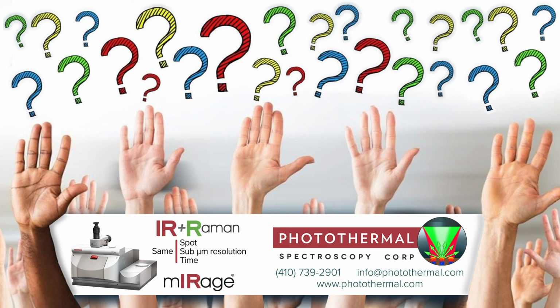All right, so this is something that I get quite excited about, because we talk a lot about spatial resolution. That's quite clear in the images, in the fact that you can see smaller things. But there's an added benefit which isn't always obvious, and that's when you have that higher resolution, it means that you are now collecting spectral information from a very small spot. So you're not averaging over a large spot, as you would be for, say, a traditional FTIR or QCL type of measurement.